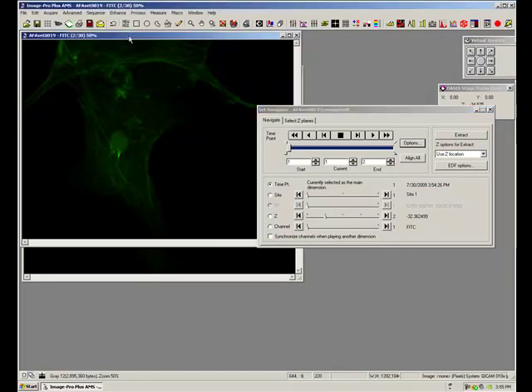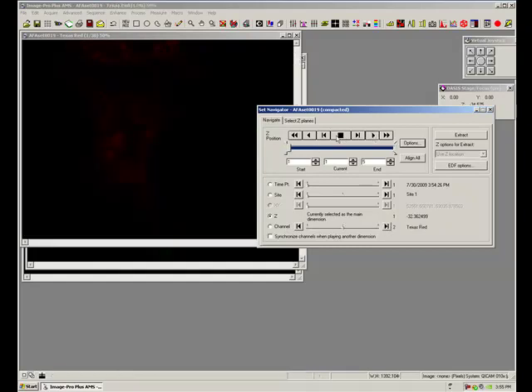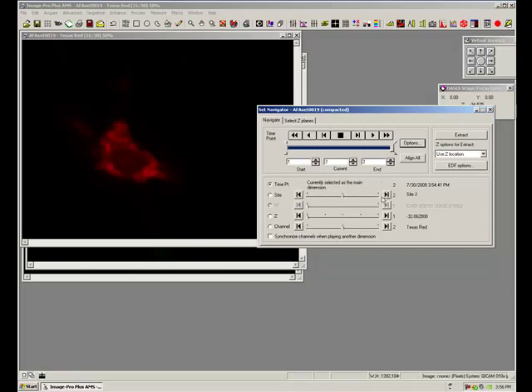Okay, so now I can look at that over time. You can see this is on my bench in my office, and not much happens in 2 time positions. I can look at Z. Maybe I just want to extract that channel, or maybe I want to extract this channel out as well. Either way, I can navigate my way around. I can look at time point 2, site 2, at Z position in the middle. Glorious, lovely image. Okay, well I hope that gives you an idea about how AFA works.